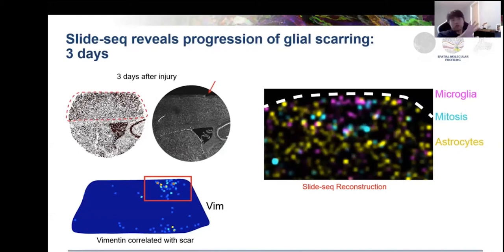Surrounded, and this is just visualizing 3 cell types. There are obviously neurons and other cell types which we're not showing here, but surrounded by astrocytes.